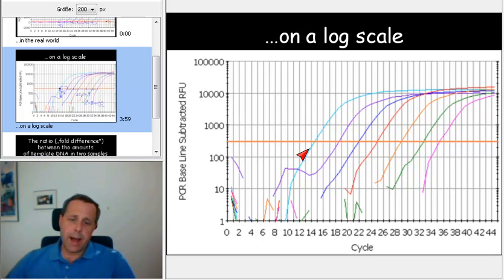So what you can now appreciate is the amplification of our PCR products even at low amounts. That's something that you couldn't really see in the previous scale but now you can see it and now you can appreciate how sensitive your detection works.